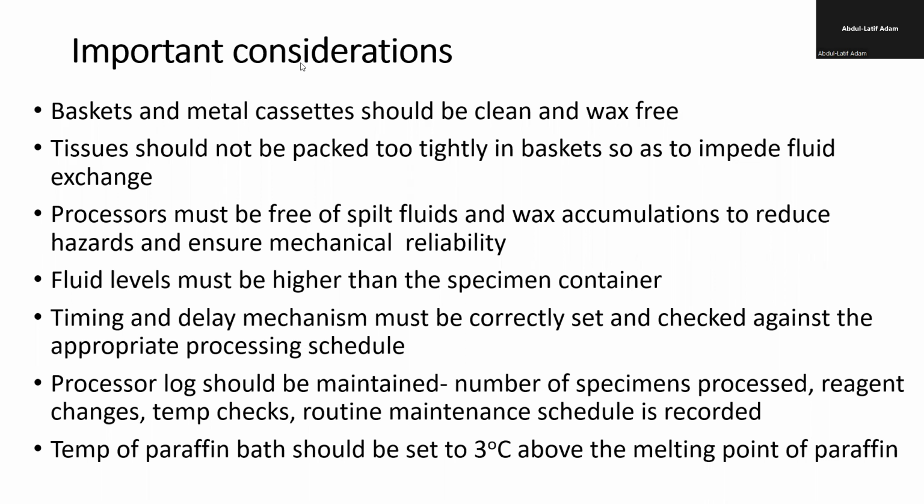Okay, so infiltration, as I've mentioned to you, is hot, it is high temperature. So the sample will be there, it will be drying, and by the time you get there, the sample is brittle. And at the end of the day, nothing can be done with the sample. So if you are setting delayed timing, you have to be very careful.